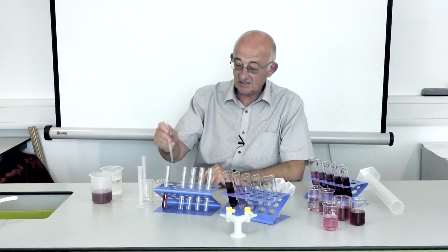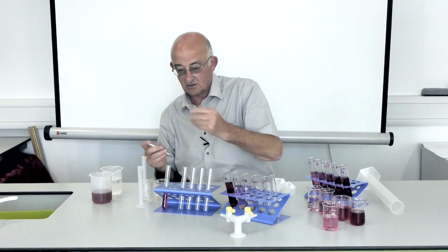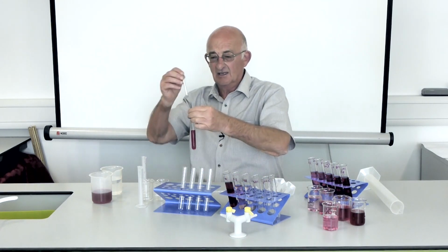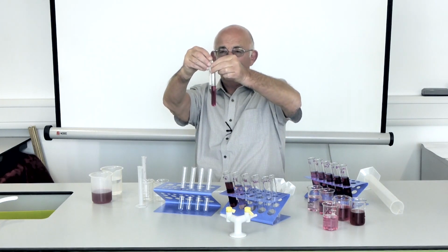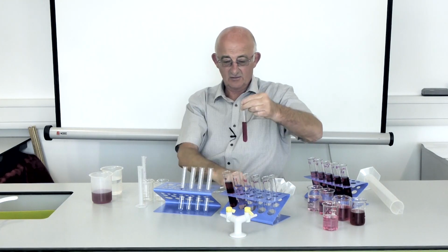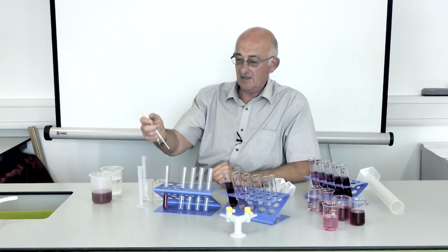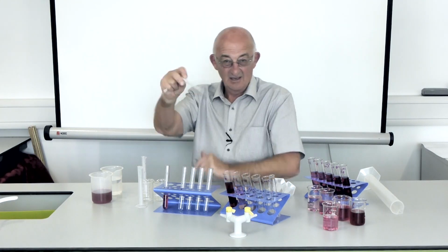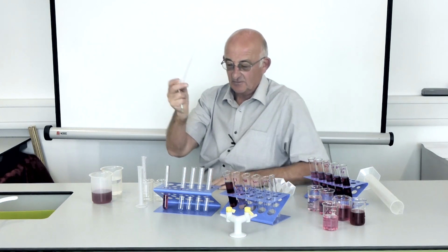I could use a pipette, I could use a syringe to take out 1 mil, and this is where you need to, I suppose, give students a little bit of chance to explore. If I'm going to take 1 mil out of there, it might just about be not quite far enough for that syringe to fit in. It certainly won't work with anything else. It could work with a pipette, but how trustworthy are the measurements on your pipette?